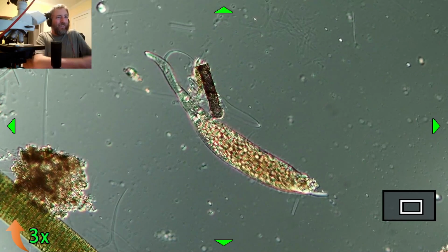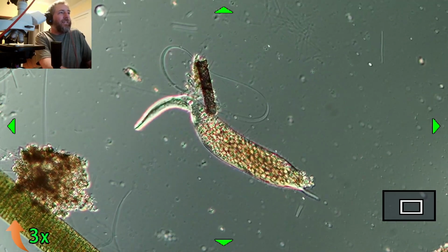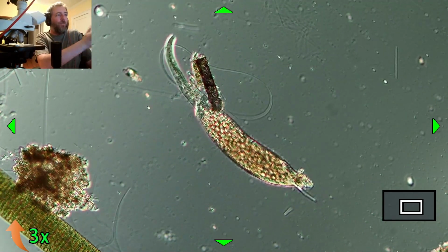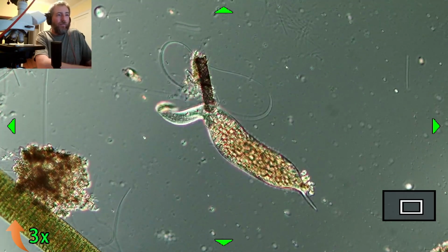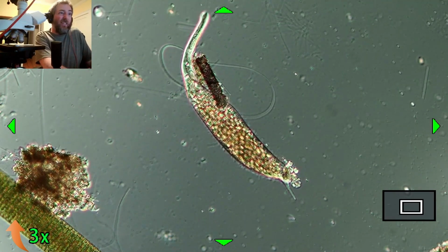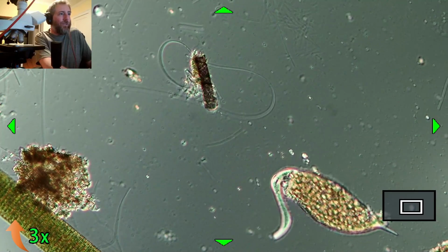The microscope that I use is... Why are they usually side on for the microscope? Yeah, so I don't think that they necessarily are. I think that they've got sort of like two possible positions that they could easily be in. They're laying on. So that's just because they're asymmetrically shaped. They're shaped like a lens in profile. So they just pooped out some stuff.